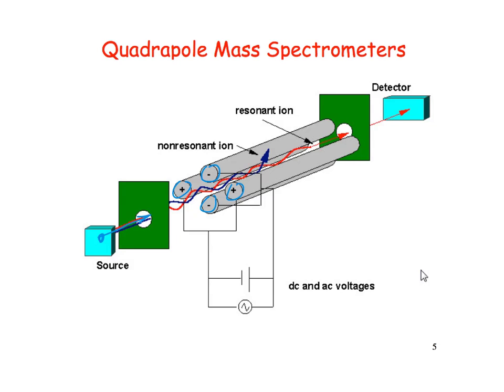So you might think about here it has a plus, plus and minus. If you have a cation going down here, it's going to be attracted more towards the minuses and repulsed by the plus. But as it starts going towards the minus, if these charges switch, and this now becomes plus, then it'll be deflected off of that and go towards the minus, and then if it switches again.